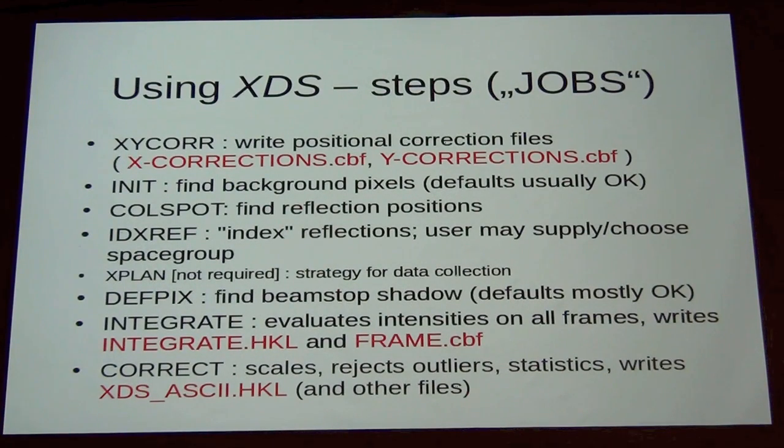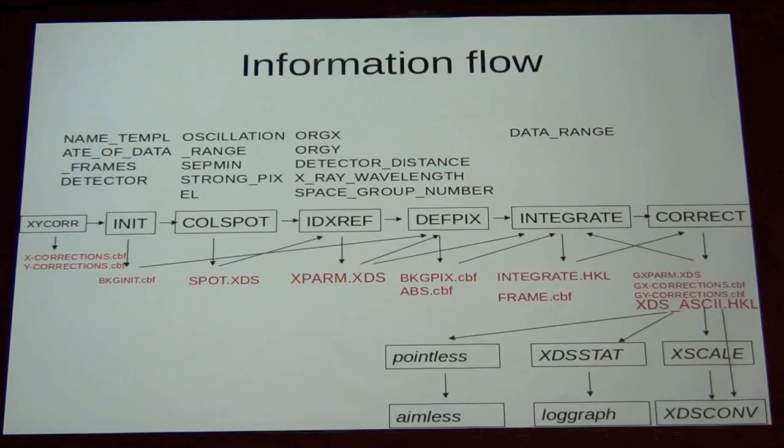And CORRECT is the scaling step. It puts out statistics and writes the final XDS_ASCII.HKL and a number of other files. So this is all very nice in principle. So this summarizes, or gives you the information about, the data flow here.